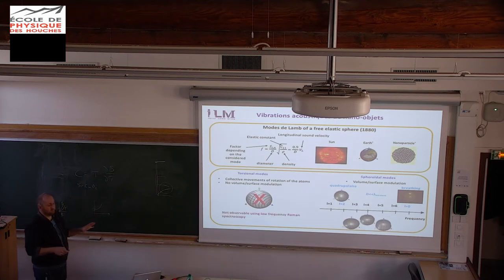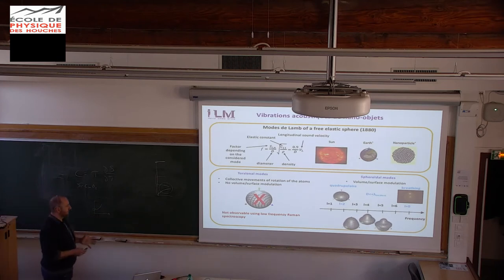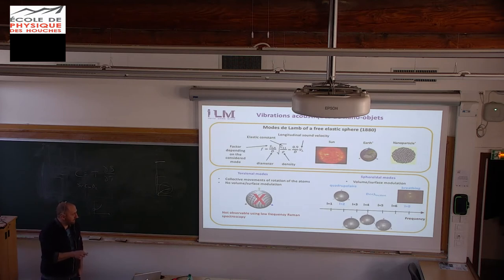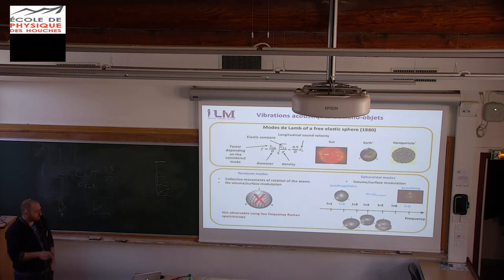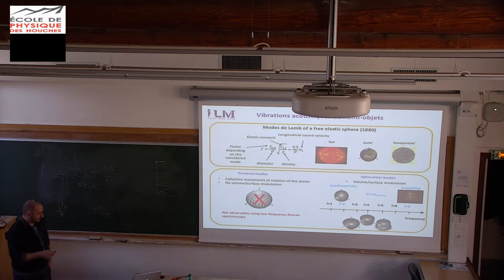In the case of torsional modes with Raman, you will not be able to detect them because there is no change of the volume or surface modulation. So you will not detect this. Generally, with low-frequency Raman, we essentially acquire this quadrupolar mode, sometimes a breathing mode. And these other modes are sometimes seen, sometimes not, and I will show you that we can maybe control that.